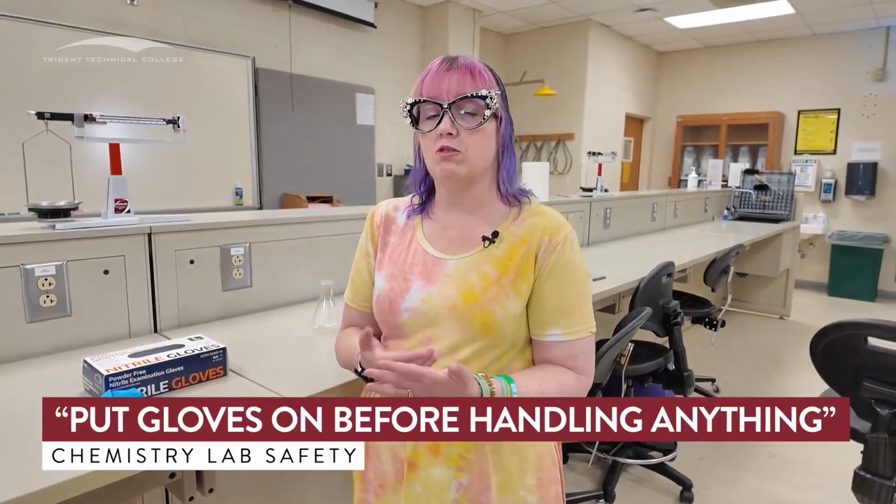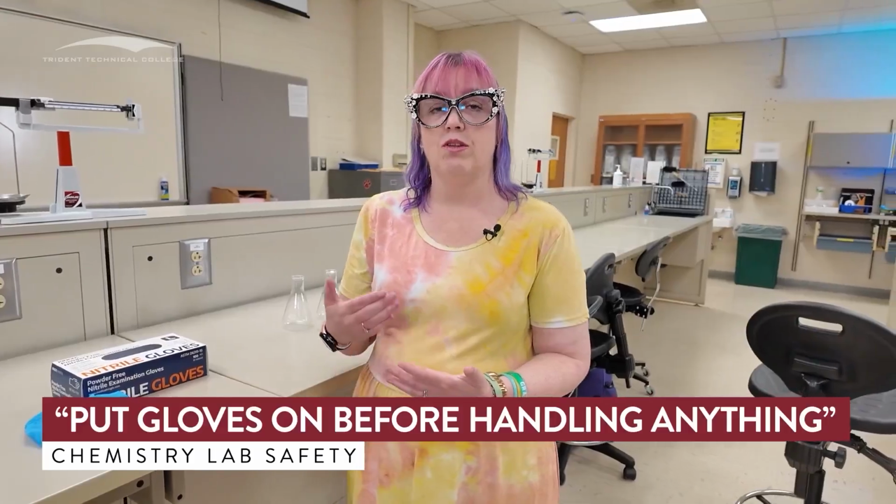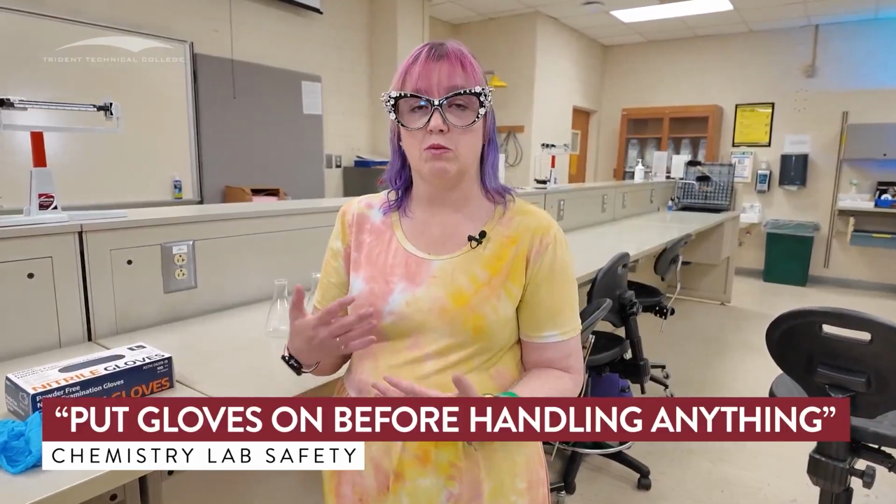Now, things that we need to make sure that we're dealing with when we talk about these experiments. We put those gloves on before we handle anything, because you may not be the first lab for that week. So the things that we're dealing with may not be as clean as we want them to be. So we want to make sure that we're dealing with everything in gloves. Anything that we deal with in the lab needs to be done that way. Anytime anybody is working with anything, doesn't matter if it's chemical or not, for those labs, we need to be wearing those gloves, okay? So I think that's everything I need to talk about with the gloves.